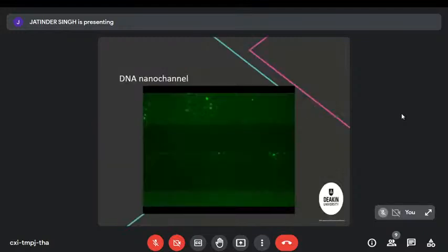So I'd first like to show you, here we've got a microfluidic structure. We have DNA that's all coiled up sitting here in a chamber. Then the more black area here are nanopores. And if the movie starts, there's an electric field applied and you can see the DNA uncoiling, stretching and finding its way through the pore.